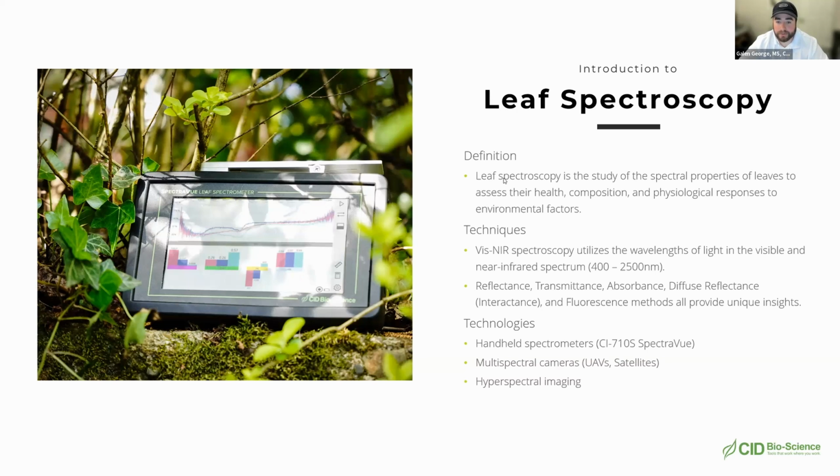Can the graphical representation of data be transferred? That's a really good question. Unfortunately, we don't export the actual physical graph that you can see of the spectrograph on the device screen. What we export are the specific transmittance, reflectance, and absorbance values for each of those samples that were taken at each wavelength range.